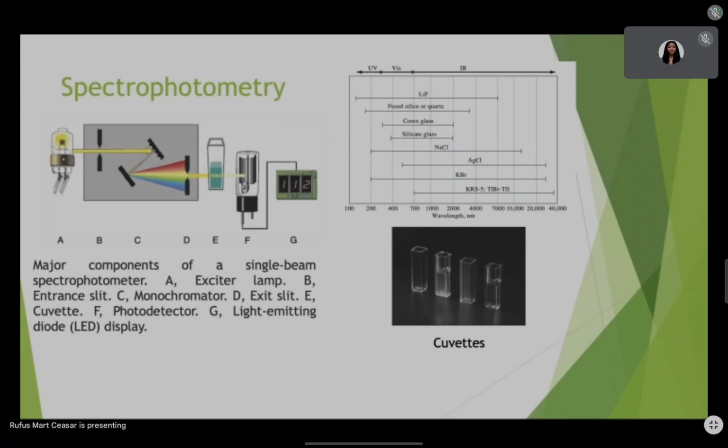So, next slide. So we have here a cuvette. Yung nasa taas, kinuha ko sa SCUG, yung SCUG na analytical chemistry. So a cuvette is a small vessel used to hold the liquid sample in the light path of the spectrophotometer for measurement. Usually, square or rectangular yung cuvettes kasi kung kunwari, round siya, pwede siyang kahit transparent siya, pwede pa rin siyang mag-reflect or mag-diffract ng light.